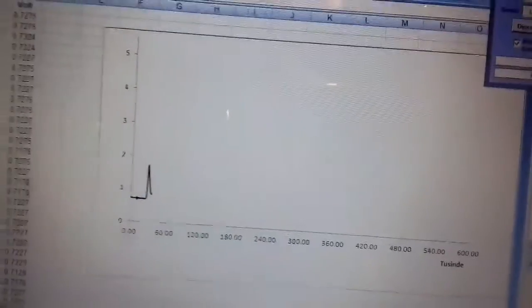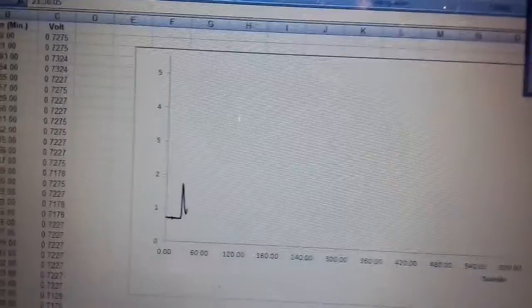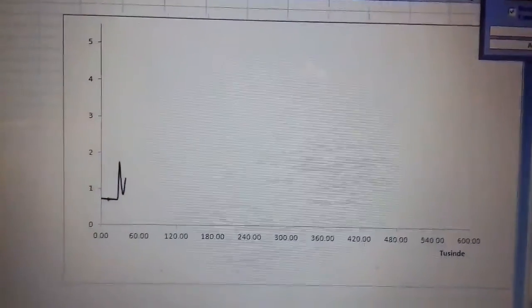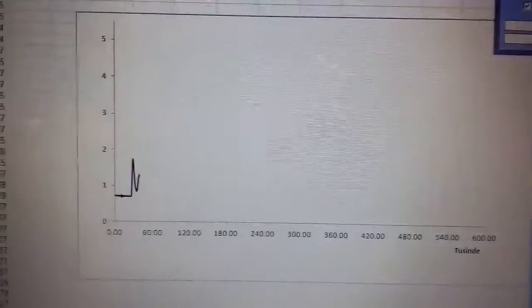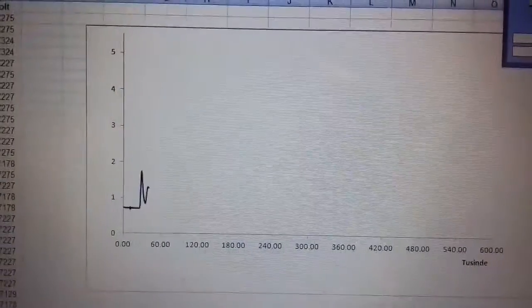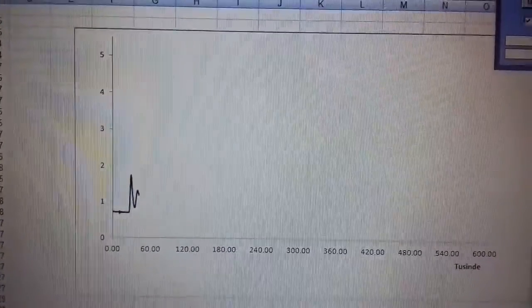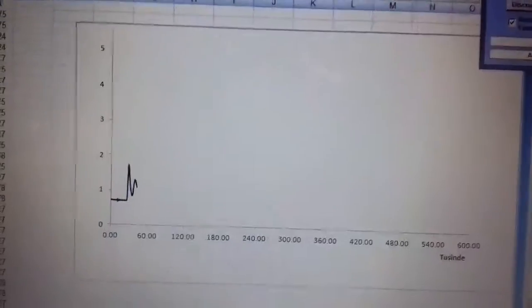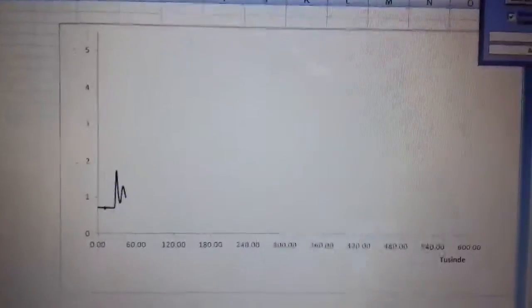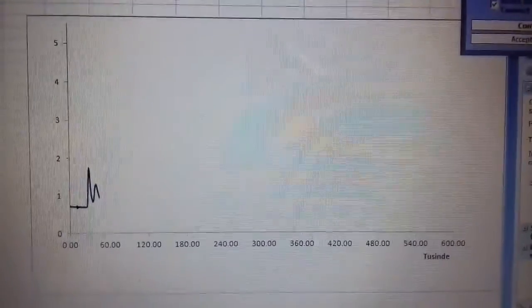Yeah, the other peak should come shortly. This is a project I decided to do after researching and figuring out that nobody else is doing this, or very few at least.